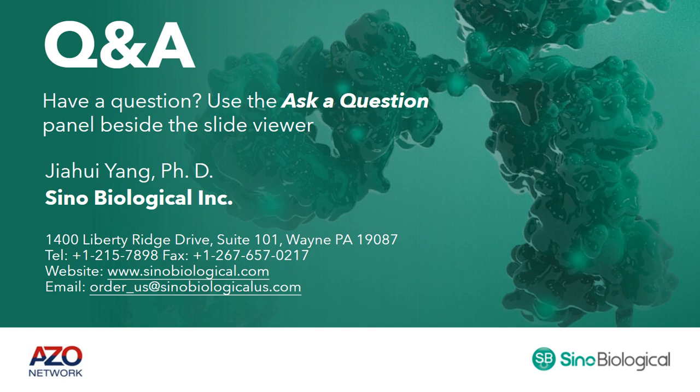Excellent, thank you. Another attendee here asked, what is the size of the antibody phage display library at Sino Biological? I have constructed a library with a size of 10 to the 9, but I still could not get enough positive clones after screening. Could you provide any suggestions?